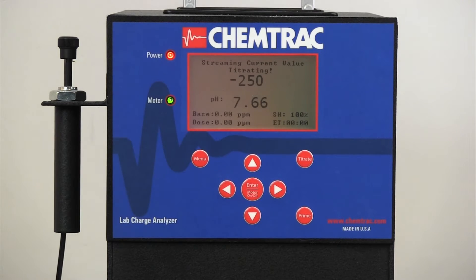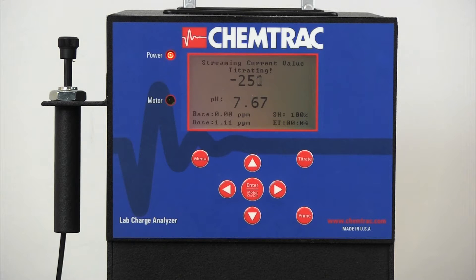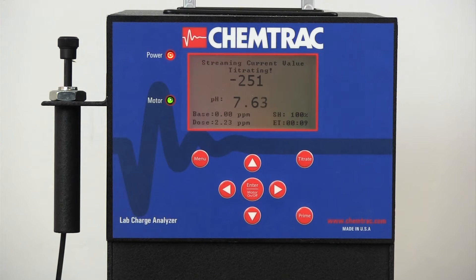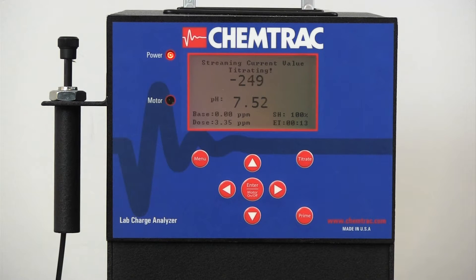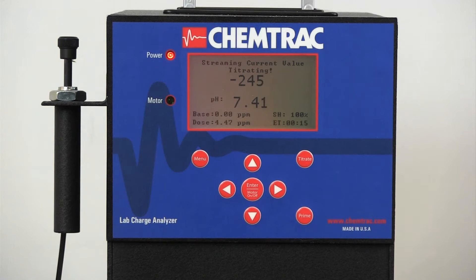Once the automatic titration process begins, the charge and pH values are displayed, along with the amounts of alum and caustic that have been fed into the sample. A timer displays the titration elapsed time, and a signal health reading is meant to indicate any potential issues with the charge measurement.